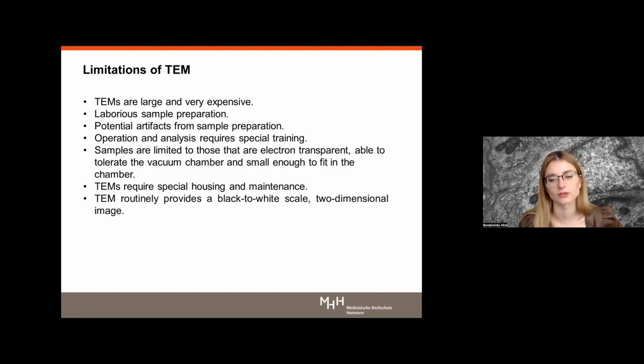Yeah, that's true. The microscope is very, very complicated, and at the same time requires a lot of attention, because when I talked with other electron microscopists, all of them told me that every week something happens with this device that needs some specific maintenance and adjustment.